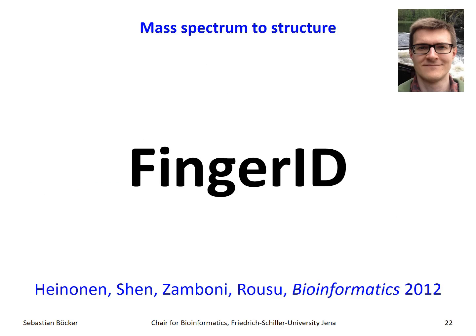And now finally, we come to the last paradigm, which is mass spectrum to structure. But before I talk about CSI FingerID, I want to talk about its predecessor, which is FingerID. And that is work by Markus Heinonen, who was back then a PhD student with Juho Rousu.